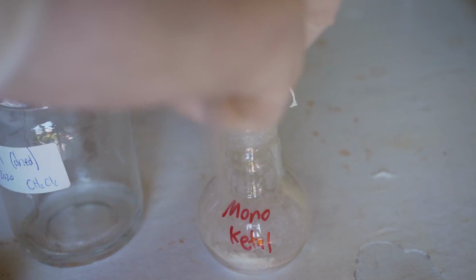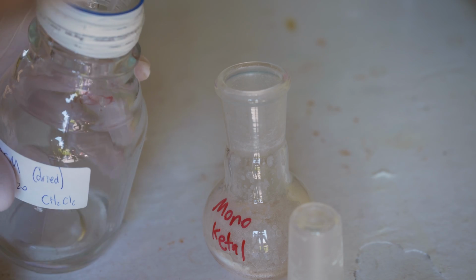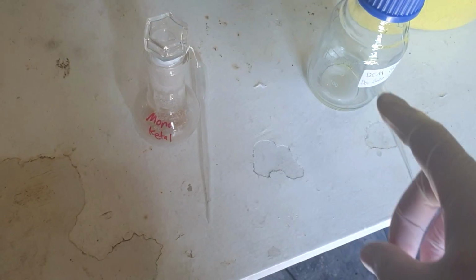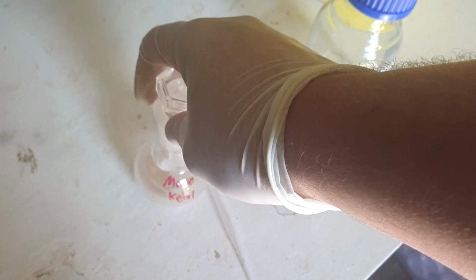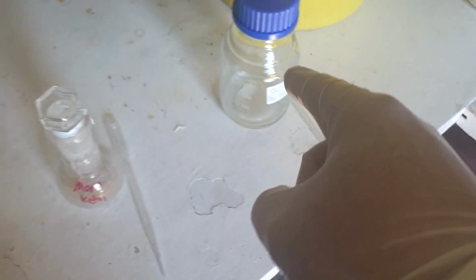Here is our reaction mix, and you might remember from last time, the difficulty is that this is a biphasic reaction mix. So we've got hydrochloric acid in water, obviously, and the dichloromethane, and we need those two layers to mix, and that pushes out our reaction time. We ran this for about 9 hours of reflux. From the NMR, we know it's progressed a reasonable way, but not all the way. So I did ask for opinions on how we could speed this up. A lot of people told me to use carbon tet. I'm not going to use carbon tet. Thanks for the suggestions.